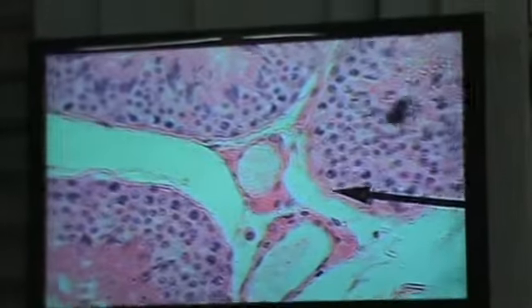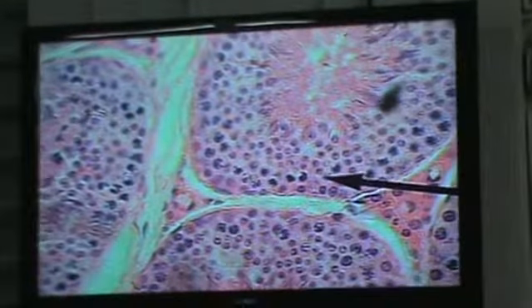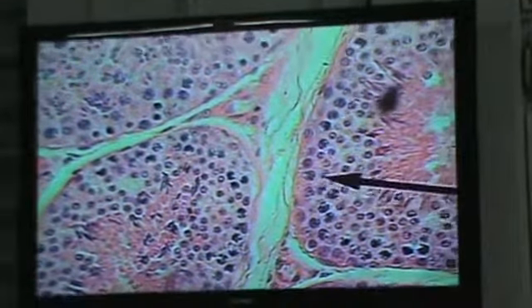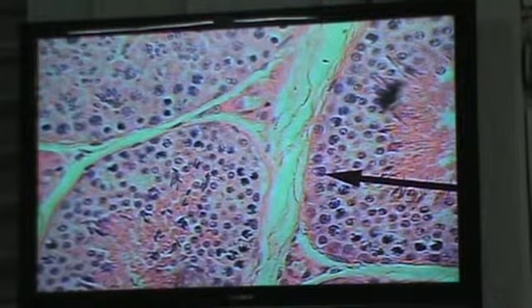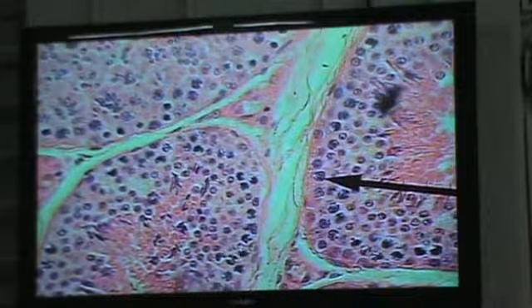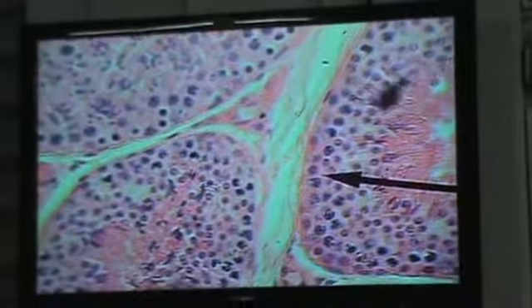Alright? So all we need to know is that they are spermatogonia. Okay? So there we see a lot of spermatogonia right here. You can classify the different types. So we can see some are sort of resting and relaxing. Others here are in a state of division. So this would be a B. And you can see other guys there just resting here, not doing much. So these are the A guys. And these very active guys, these are the B guys.